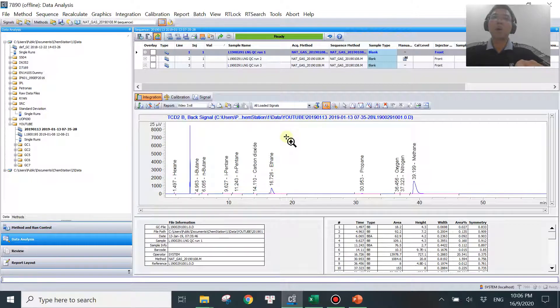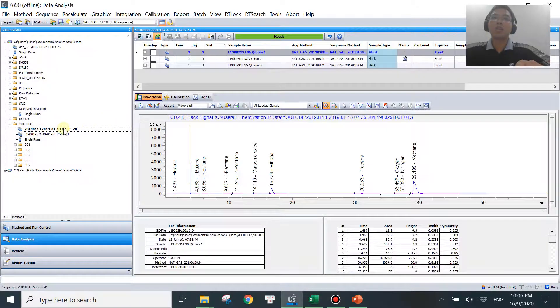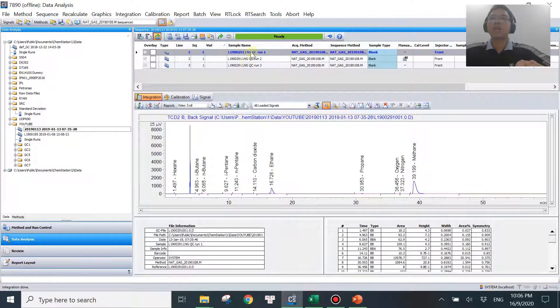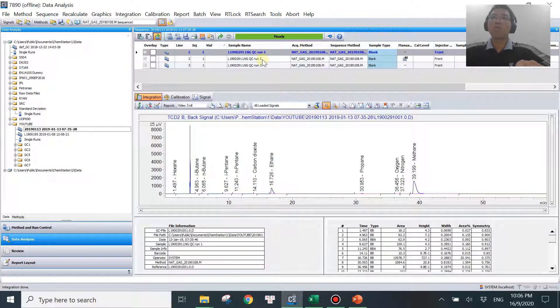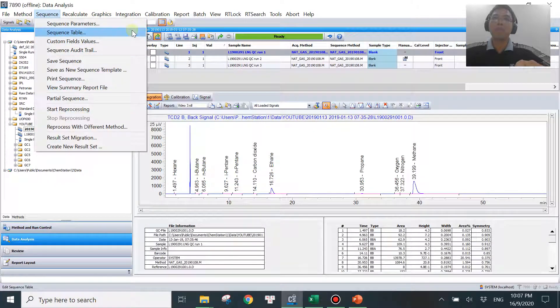I'm going to show you two common ways that should work for most of you. The first one is running by sequence. When you double-click on your sequence you'll get something like this — these are the data in your sequence. If you don't see this table, hit this button here. In my sequence I have three runs. If this little button is available, or if you go to Sequence and see all your options are available, you know you are eligible to use this method.